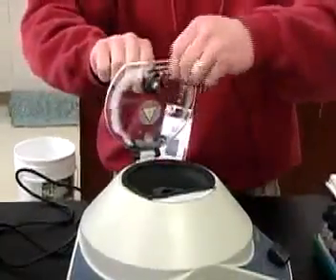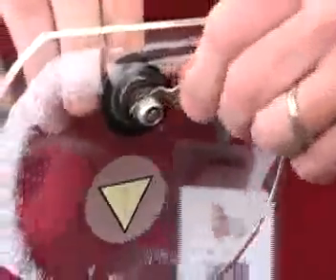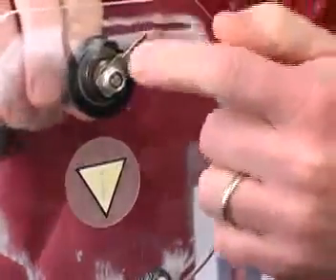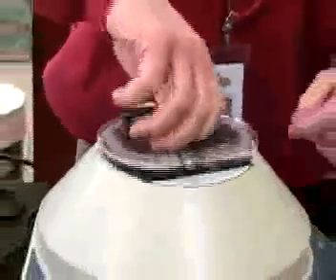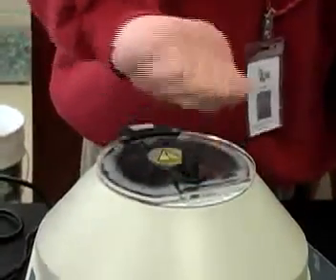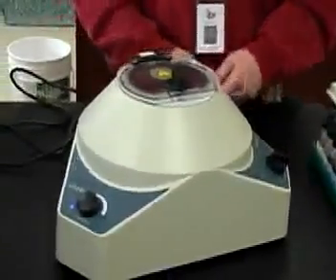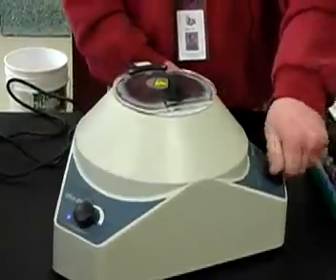And this part of the cover right here is actually a conductor of the electricity that runs through and makes it spin around. So if it doesn't work sometime when you're closing it, you probably know that maybe this needs a little filing down, or it's just not conducting real well. So once you load the centrifuge properly, close the top of the centrifuge, and then turn the knob and make sure that it engages properly with the inside of the centrifuge. Then you can turn it on, and generally you want to centrifuge for 2 to 3 minutes.